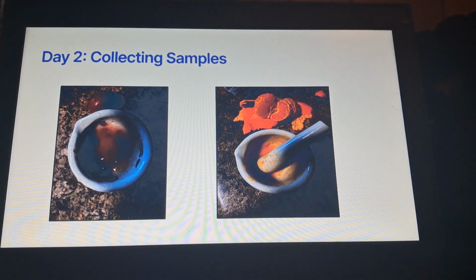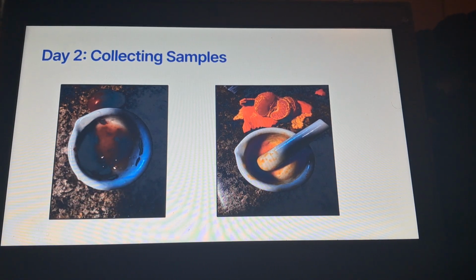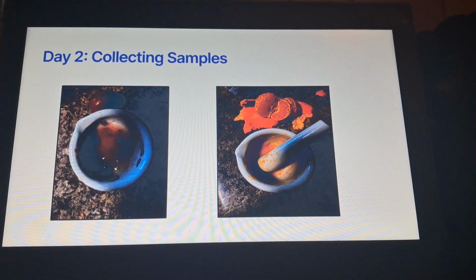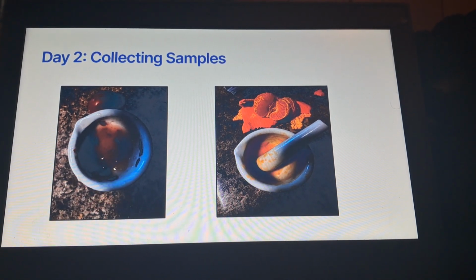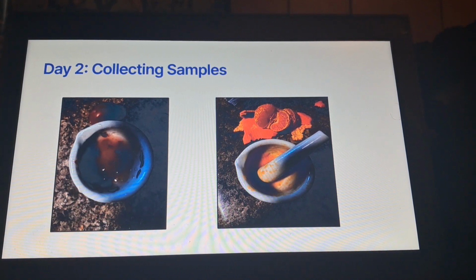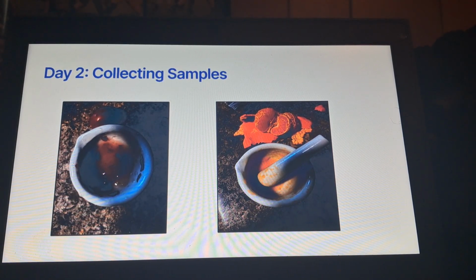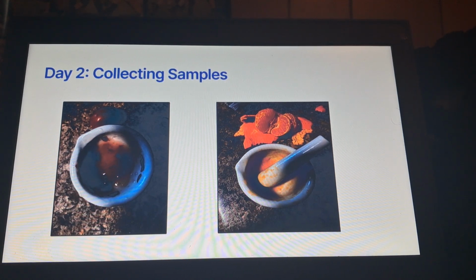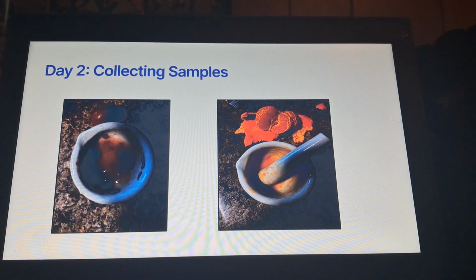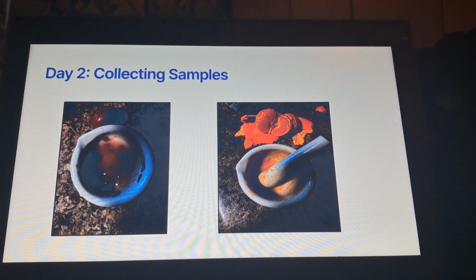And then we had to collect our samples, much like this. There's the grape, and there's an orange, and basically what we did was we had this broth, this LB Media broth, and we had our fruit, and you would clean out the mortar and pestle from the test that you just did. You would add the fruit, mush it down into a fine paste in a liquid, and then add a little bit of that, but you wanted to keep a strong concentration of whatever antimicrobial you were testing. So you get like a slurry, kind of like on the left.